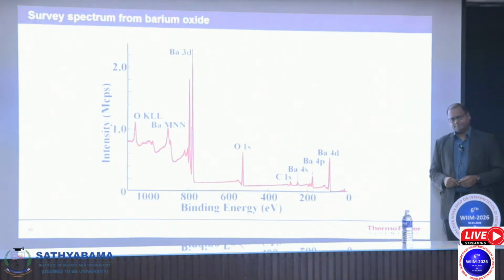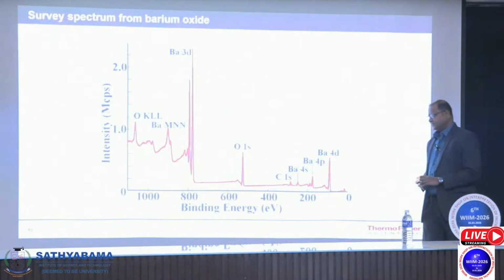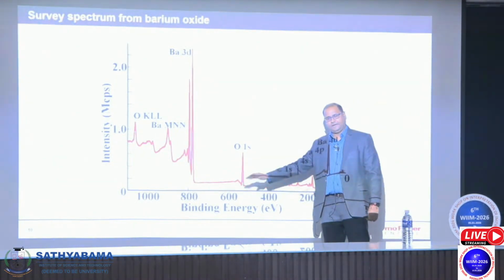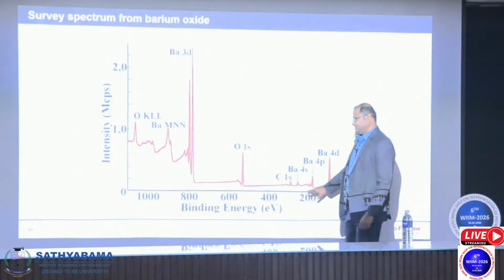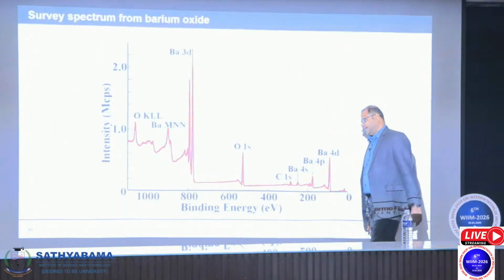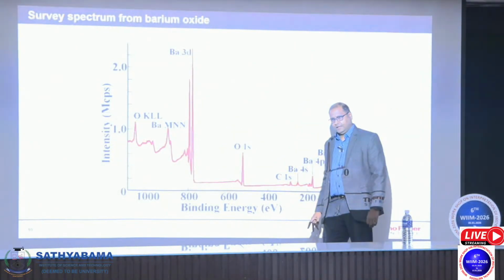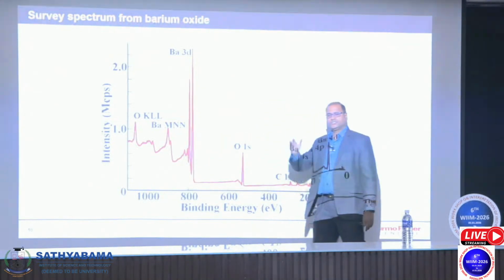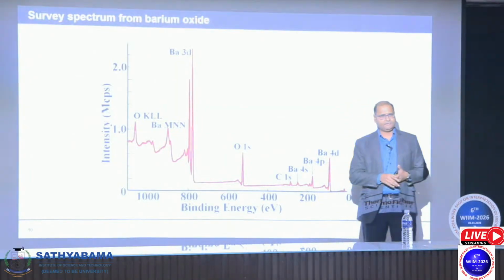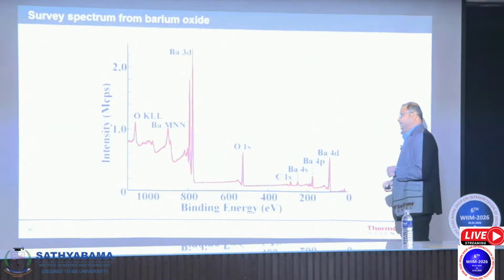So when it comes to an XPS, usually there are two kinds of measurements every user will do for every sample. The first measurement is called a survey scan. The survey scan helps you to scan across your sample over a wider energy range. So when you scan across a wider energy range, you get to know every single element that is present on the surface of the sample. And depending upon the number of counts you get for a particular element, the intensity of the curve goes high or drops down. So that gives us a fair idea of what is present, and it is also a quantified technique. It tells you how much weight percent is present. So this is the first sort of measurement that we do.